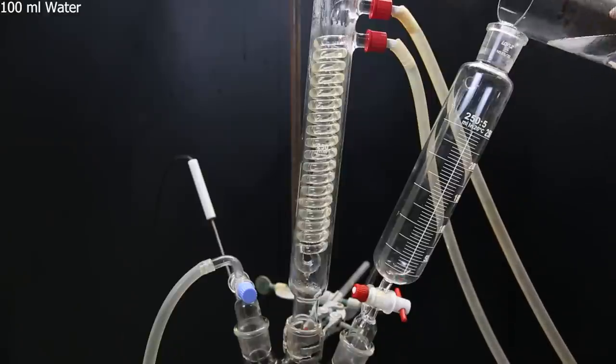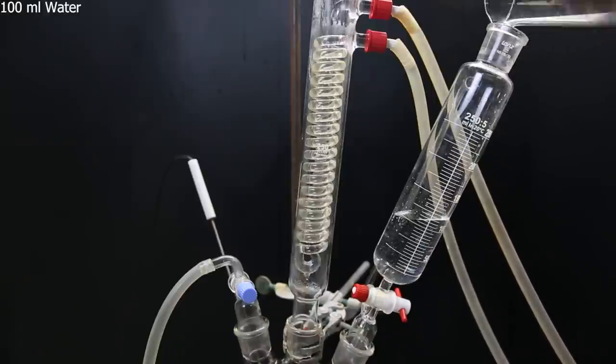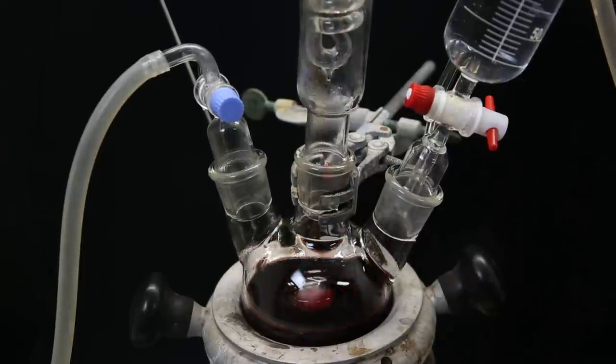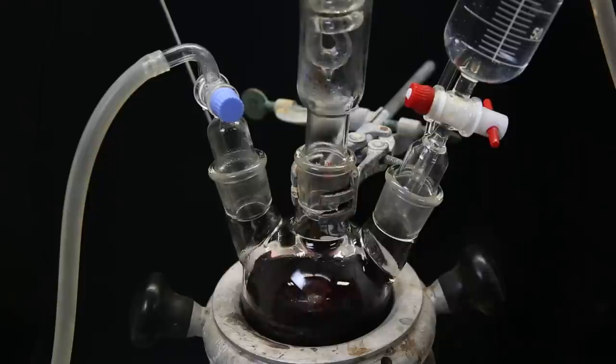I then open the dropping funnel, and add in 100ml of water. I add the water to the flask, to destroy any remaining phenylmagnesium bromide. There is a slight exotherm at the beginning, but not more after that.